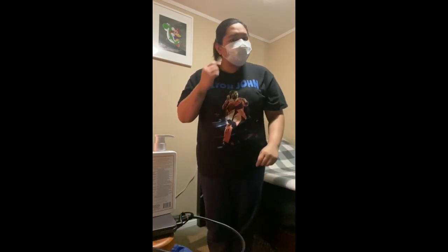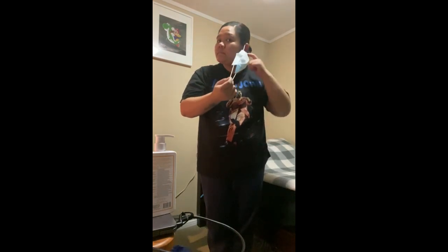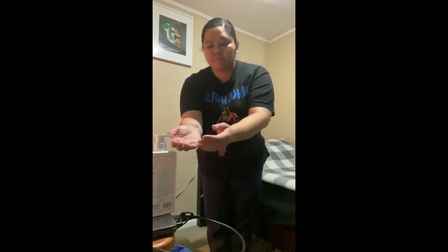And lastly, remove your mask. Bend forward slightly and carefully remove the mask from your face by touching only the ties or elastic bands, and throw the mask in the garbage. And lastly, hand hygiene.